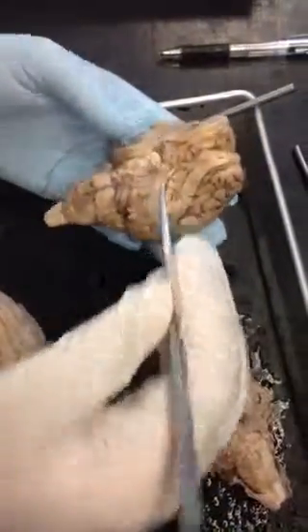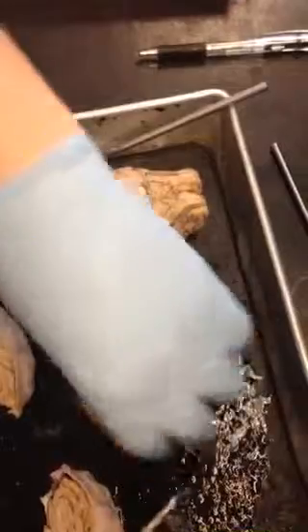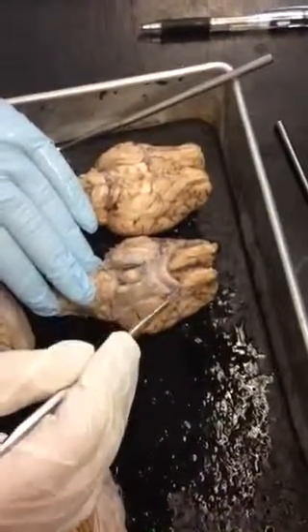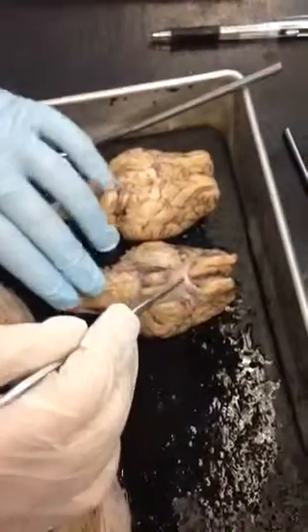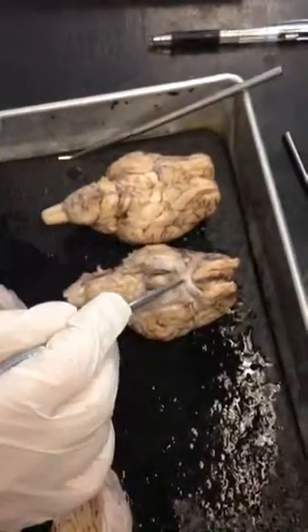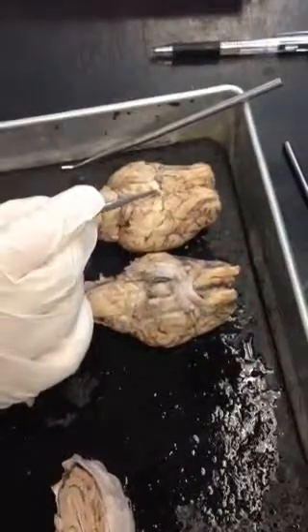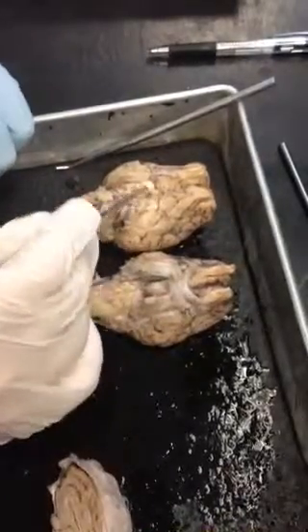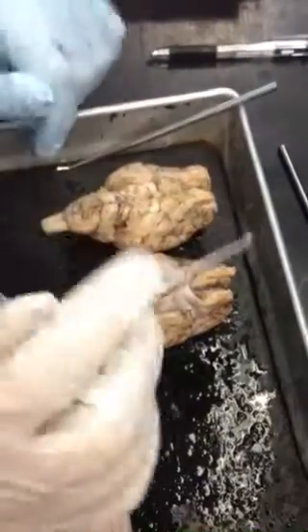The optic nerve would come off right here and branch, so you can see it on this brain. That's one optic nerve, that's the other one. You've got two eyes, two optic nerves, right? The optic chiasma, right here, is where they come down and join together. And then the optic tract would be below the chiasma, where it splits off again, right?